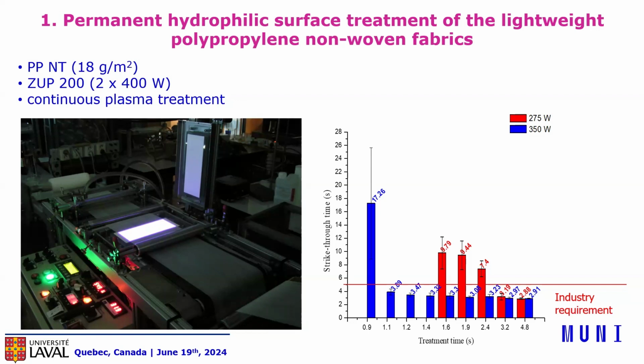And another effect is that for measuring, the principle of measuring is that you have filter papers, you place your sample on it, and you put such a plastic panel with holes, and there are two electrodes connected to the stopwatches.